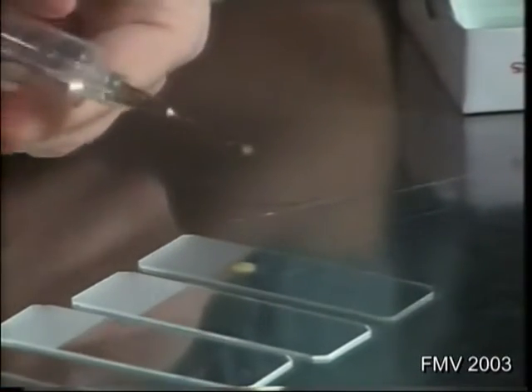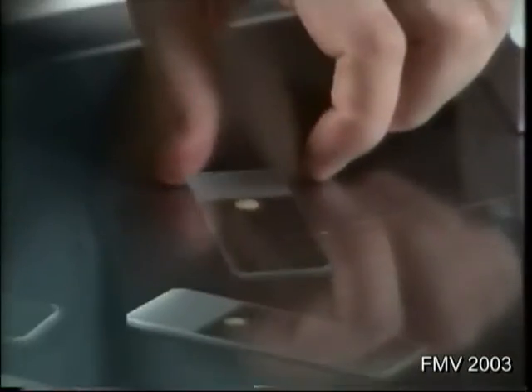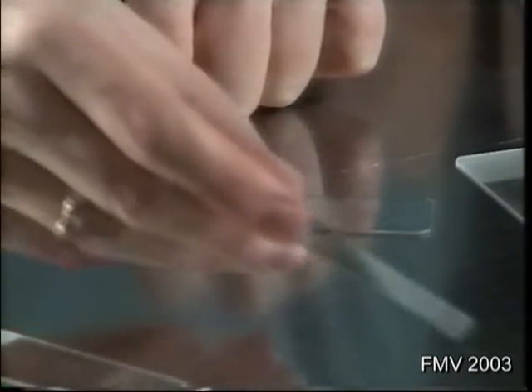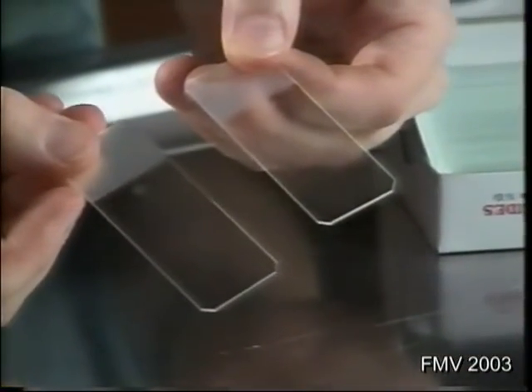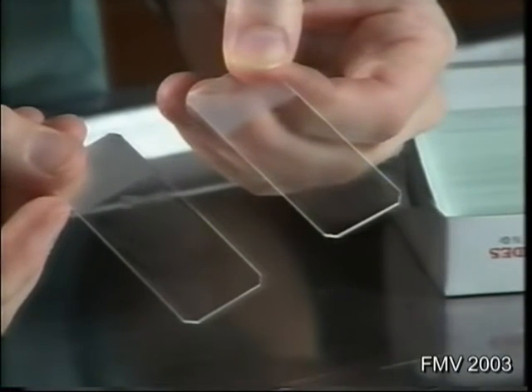If you obtain a very fluid sample, spread it with a second glass slide in a manner similar to that previously described. You may also spread the specimen with a second glass slide held at an angle, as you would for the preparation of a blood smear. However, for a cytologic specimen, stop the smearing abruptly in order to concentrate nucleated cells on one end of the preparation. Concentrating the cells in one area of the slide facilitates microscopic examination.